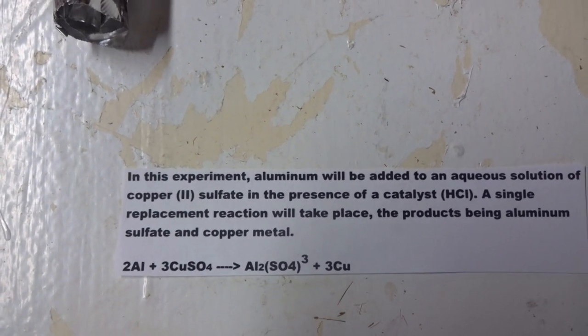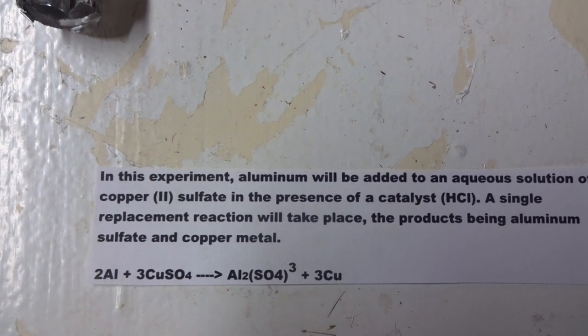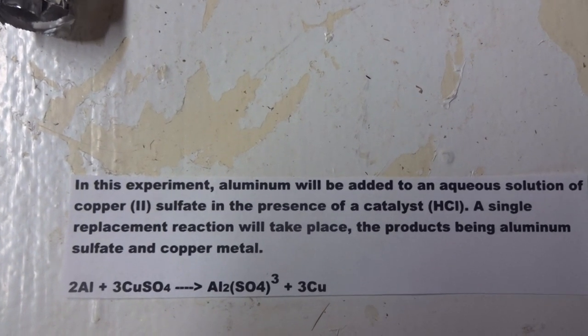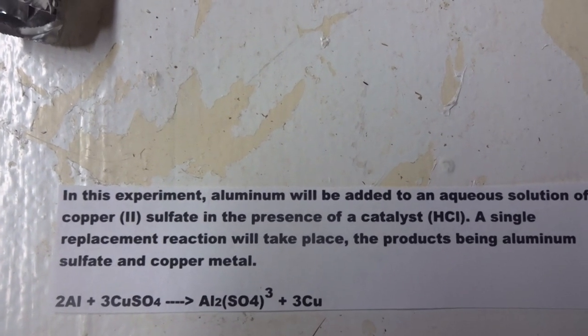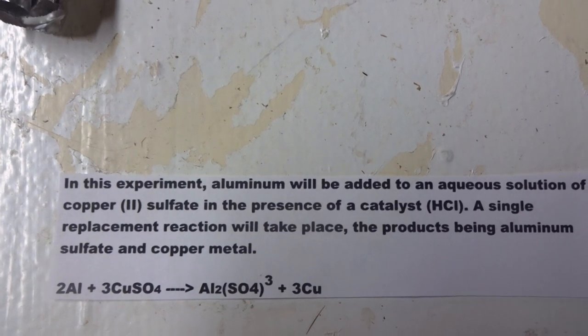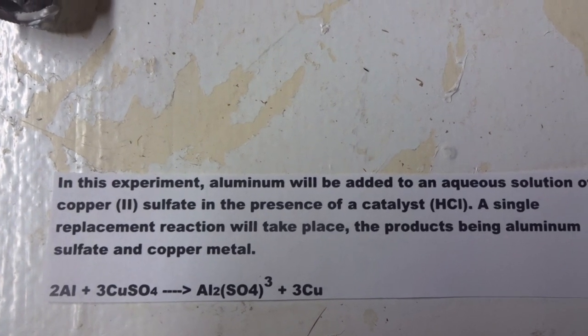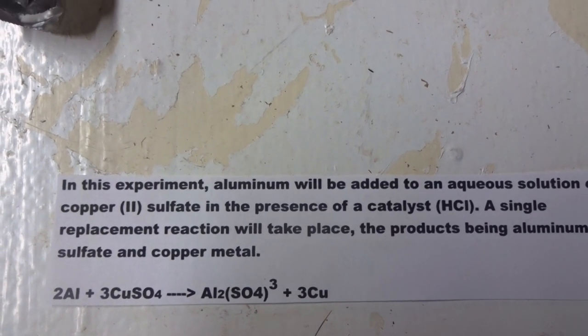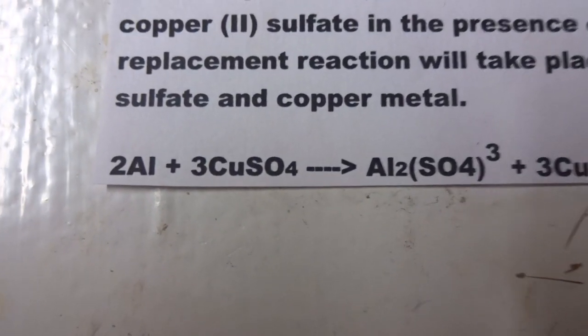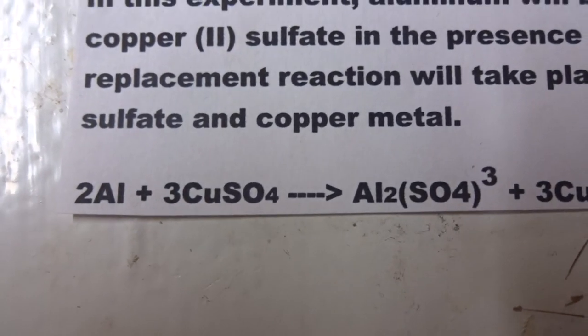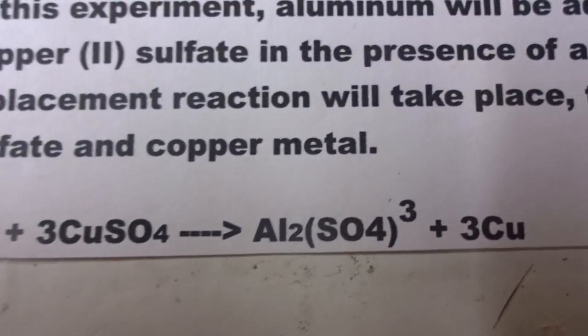In this experiment, aluminum will be added to aqueous solution of copper-2 sulfate in the presence of a catalyst, HCl. A single replacement reaction will take place, the products being aluminum sulfate and copper metal. And here we see the reaction: 2Al + 3CuSO4 yields Al2(SO4)3 + 3Cu.